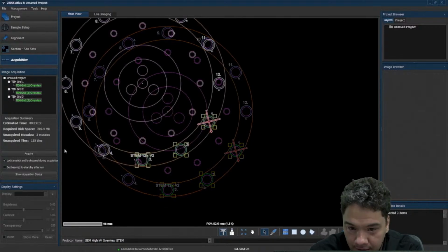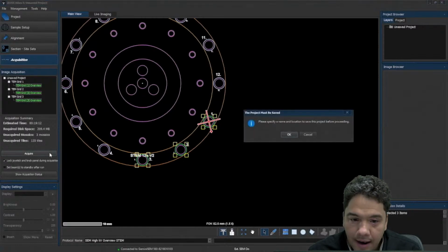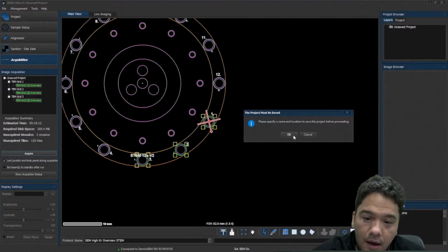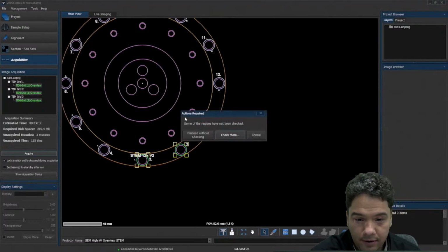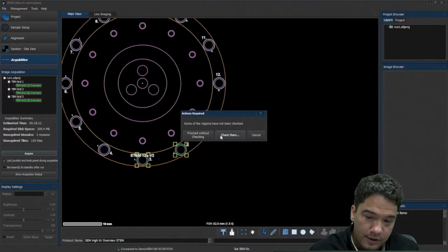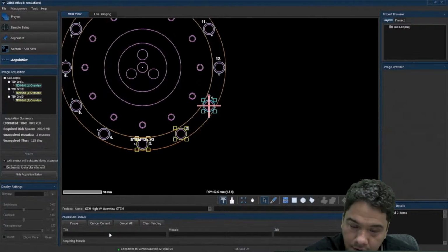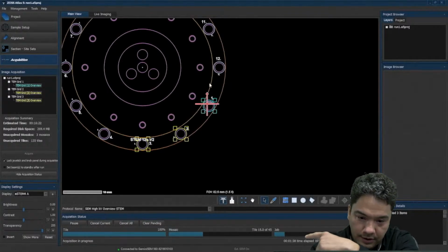After we pick our protocol, now we can acquire, and Atlas will ask for, of course, a name for our job, our base job. After we pick the proper selection or the proper area or file for this one, then we can check focus and stigmation. After that, we are going to run the overview imaging over the 3 different areas in this example. Now you can see here how the process is going.